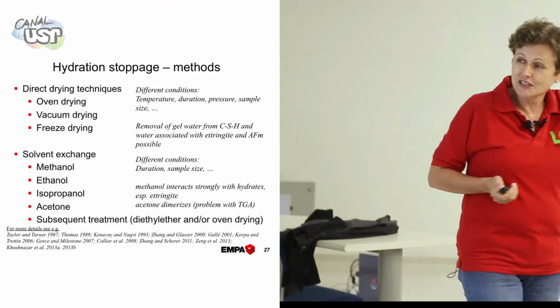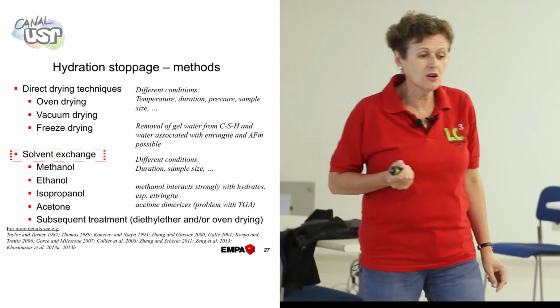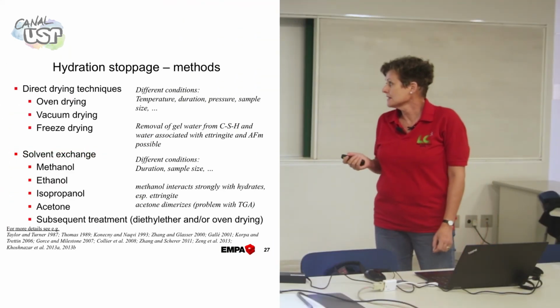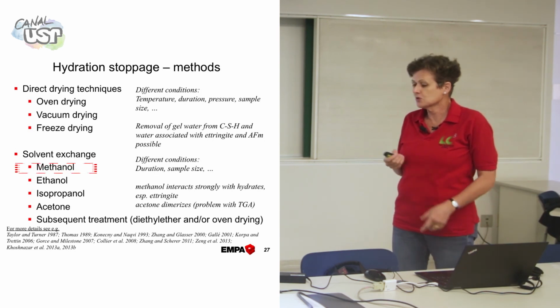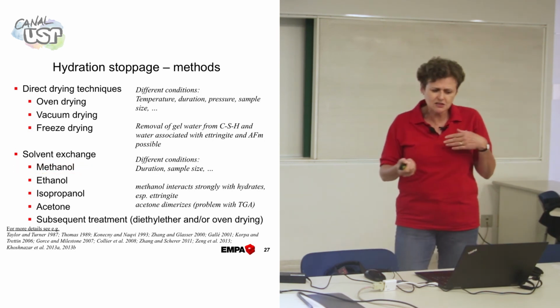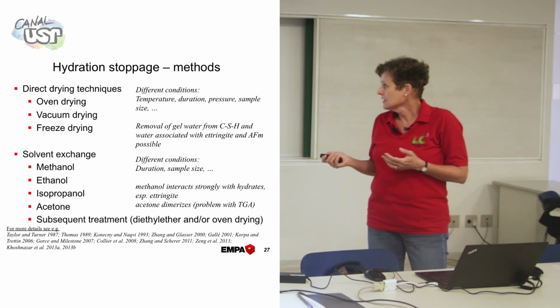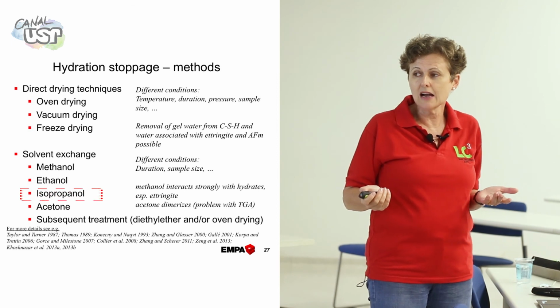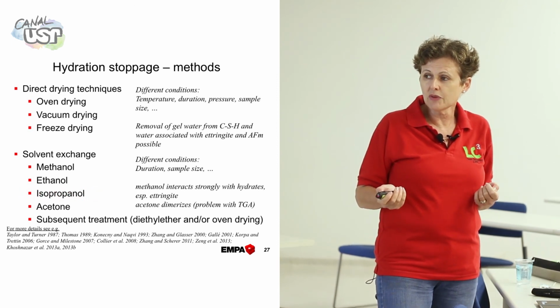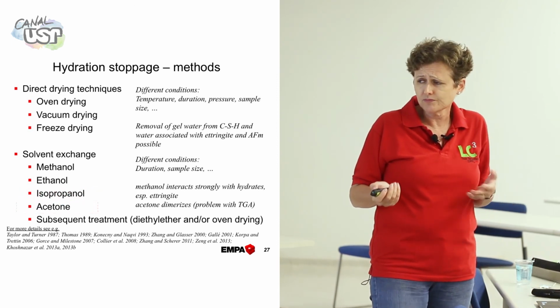Then we have solvent exchange methods. There are quite a lot of different ones you can read about. First, we were working with methanol, and then people said, oh, you shouldn't work with methanol because it's got some health issues. So then we switched to isopropanol. We're still using mainly isopropanol. Sometimes we're also using acetone.